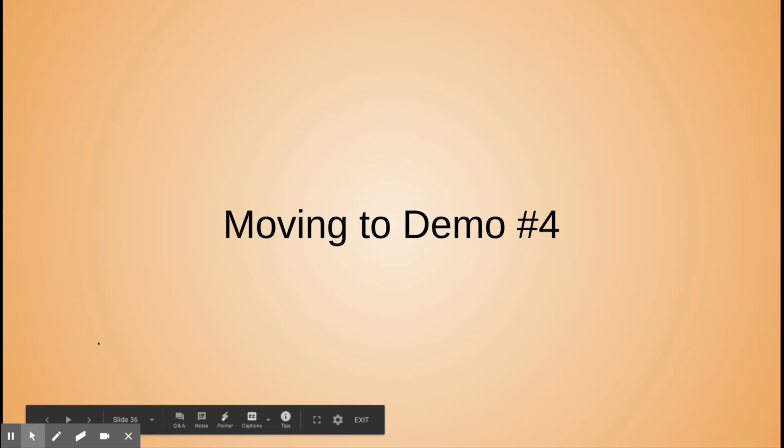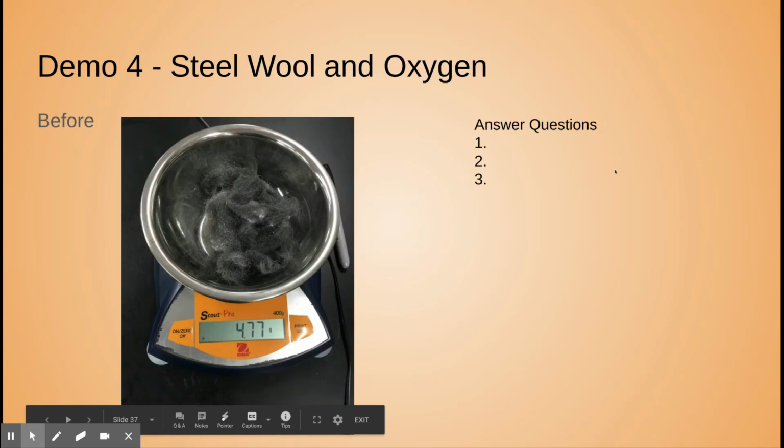Number 4, here we go with steel wool and oxygen. This is one of my favorite demos to do and to have you guys think about. And really, it almost pains me that we aren't able to do this one in class for the discussion that it starts to cause. Okay, so what you need to do is answer the first 3 questions.